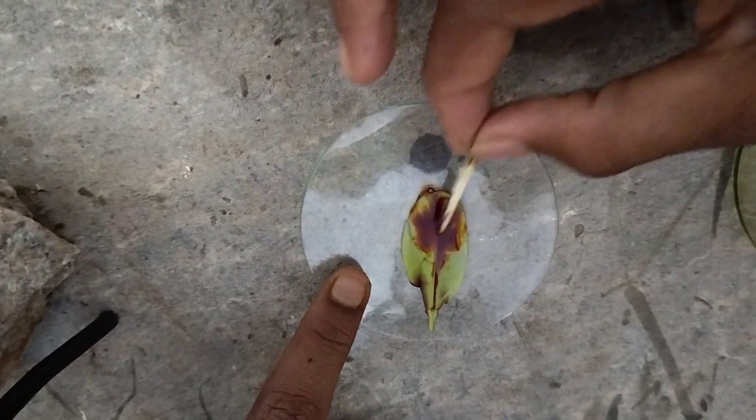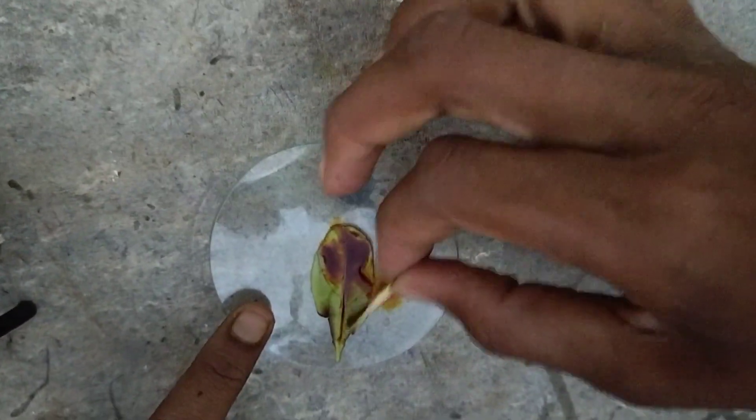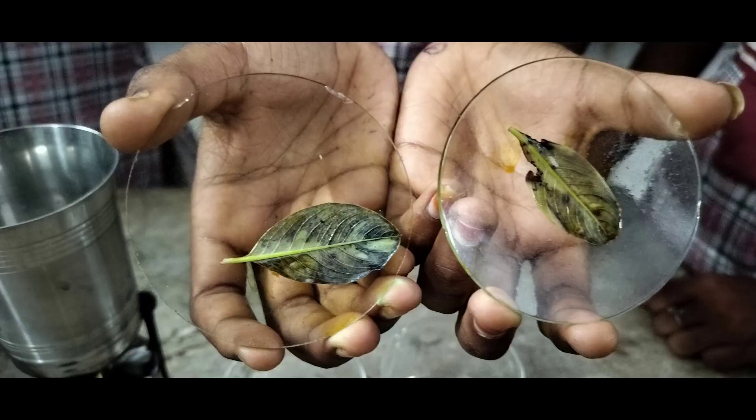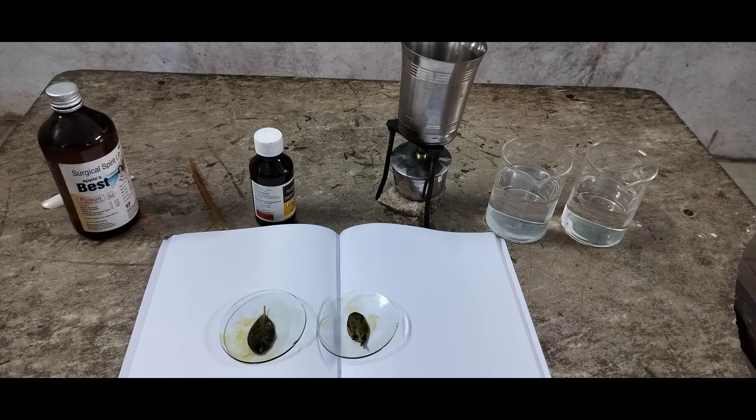The colour changed to bluish black. When a substance is tested with iodine solution and its colour turns to bluish black or black, it confirms the presence of starch. This is another leaf which we took — see the colour of the leaves changed to black. Hence it is proved that starch is present in leaves through this experiment. Hope you enjoyed the activity — do the same in your school. Bye!